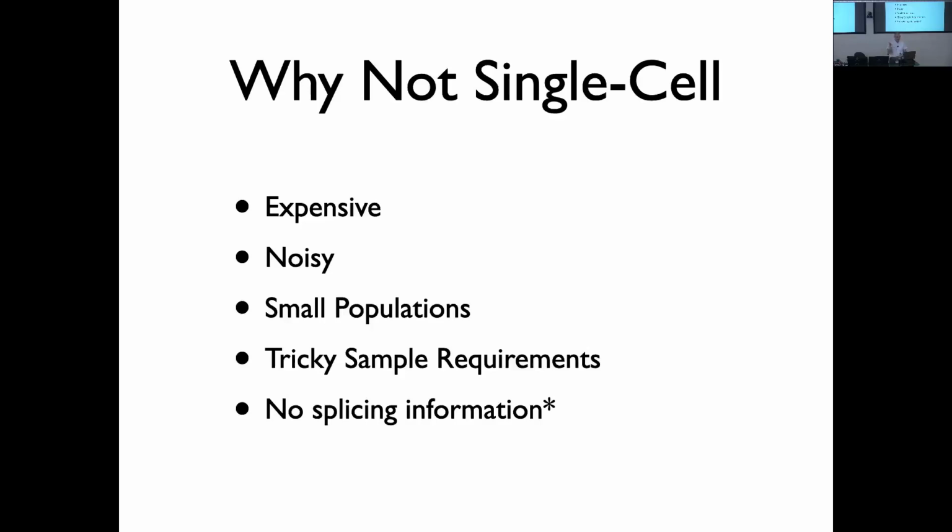I talked a few weeks ago about different high throughput sequencing platforms other than Illumina. There are now protocols for taking 10x libraries and sequencing them on the nanopore. I can't remember if PacBio also has it, but you can actually do long read single cell RNA-seq. I've never worked with any of that data. I think it's pretty niche now. I assume it's super expensive because single cell is already expensive. But it is becoming feasible, which is why I put an asterisk there.